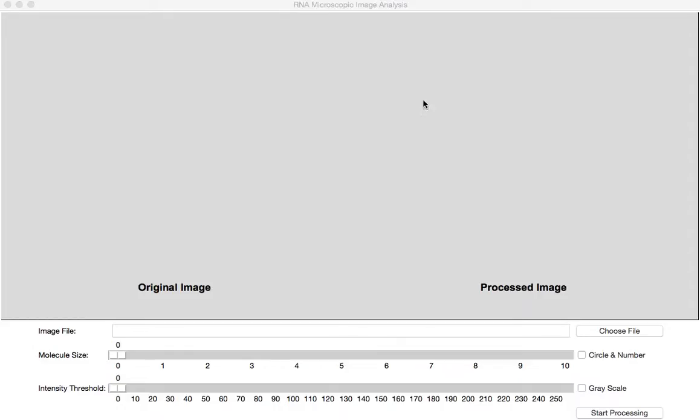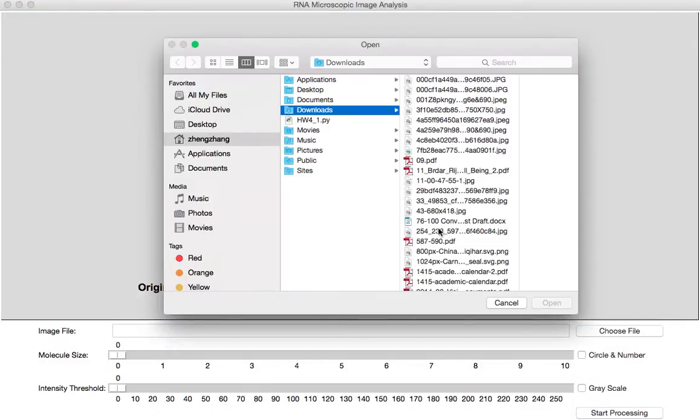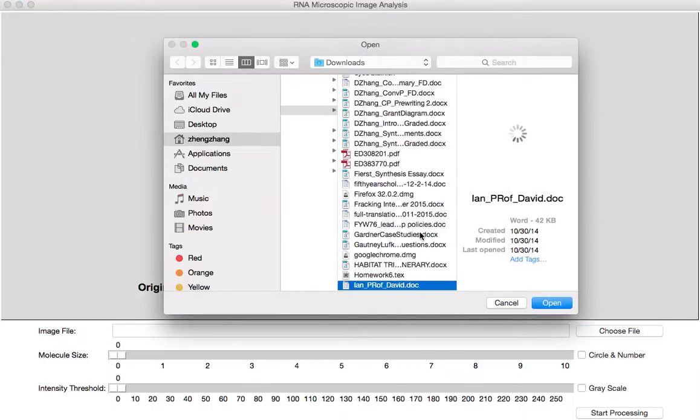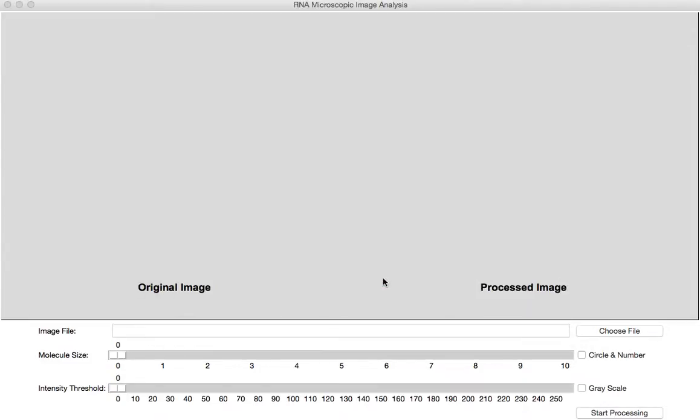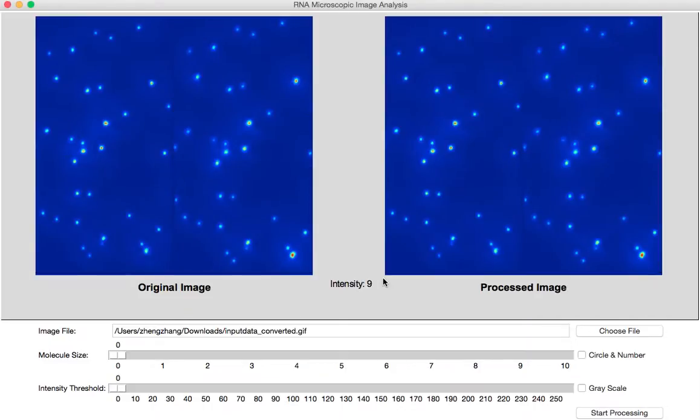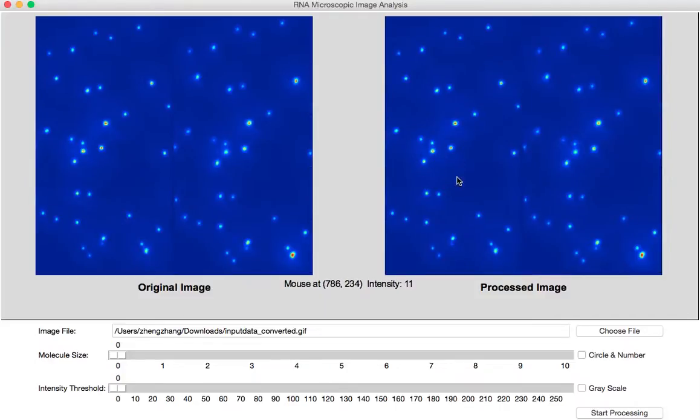First we can choose a microscopic image of RNA molecules. Now it's very important to differentiate those background noise and those conjugated RNA molecules from the single RNA molecules that we want. Then how do we do that?